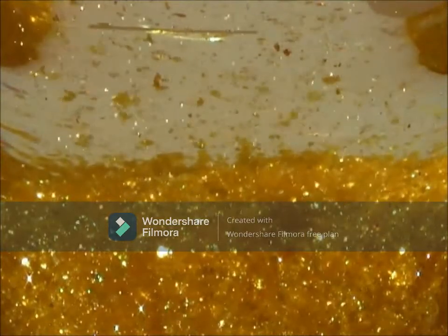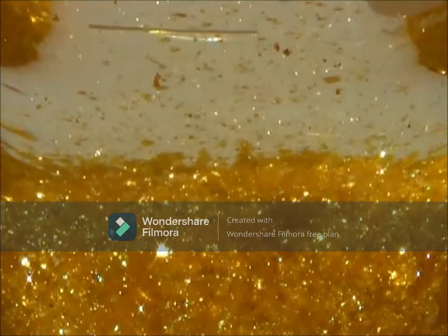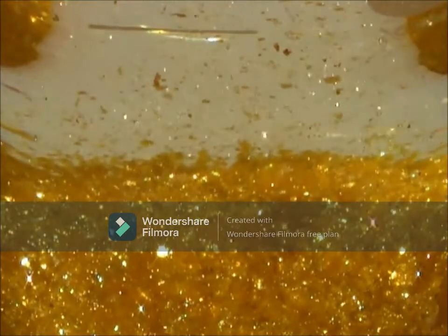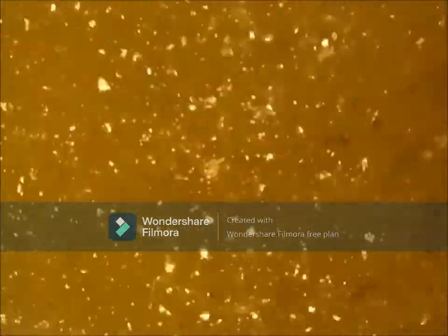Unfortunately, you can't try this in the lab because lead-2 ion is a toxic metal and students are not allowed to experiment with it at the secondary and junior college level.